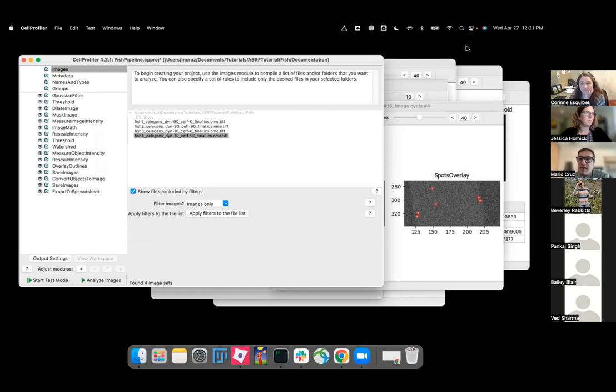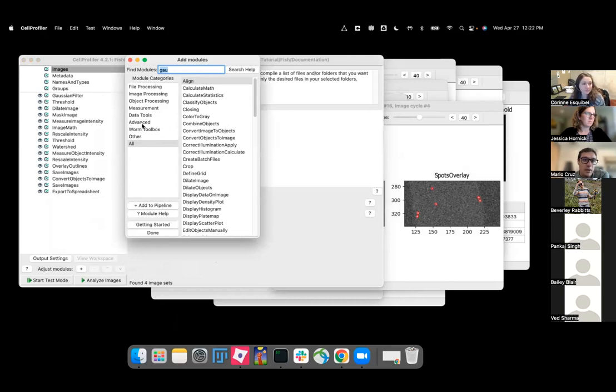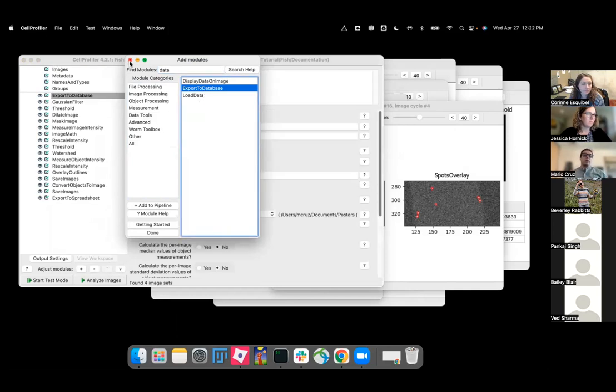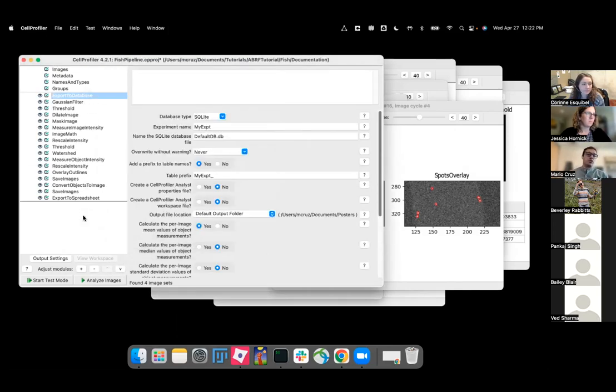Let me just see if Beth's here. No, Beth's not here. Yeah, the biggest difference here is that when you're working in export to database, you're dealing with a lot of data for sure.